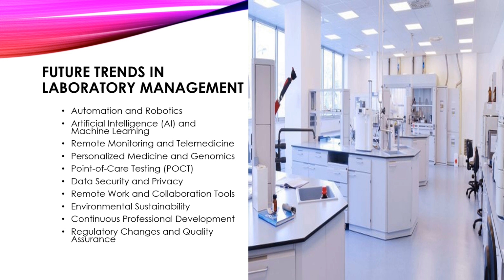Point of care testing. Point of care testing devices enable rapid testing and immediate results at the point of patient care. Laboratories may need to incorporate these devices into their workflows to support decentralized testing and improve patient outcomes.